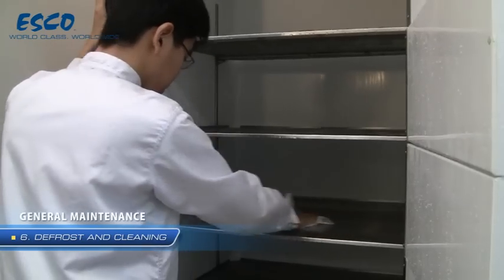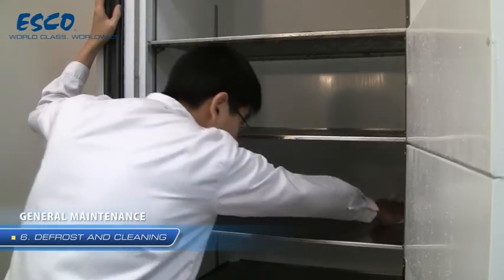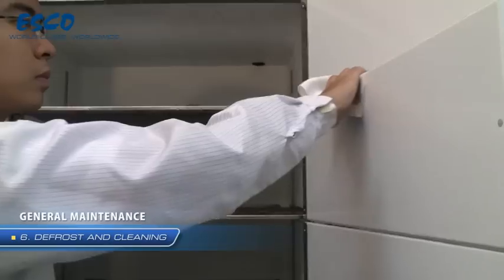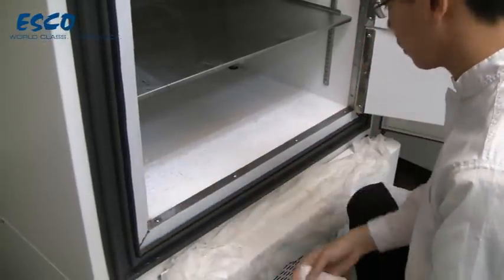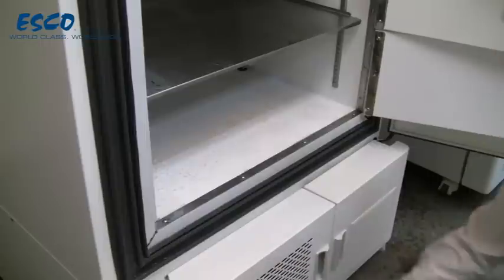Once the freezer is thawed, wipe off the condensation with a towel. Use a mixture of warm water and light detergent to clean the interior and exterior of the unit carefully. Do not let water drip into the refrigeration and electrical compartments. Once cleaned, dry and power up the unit.